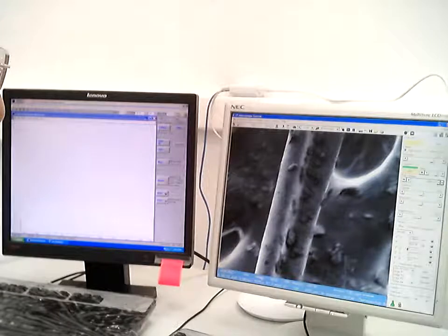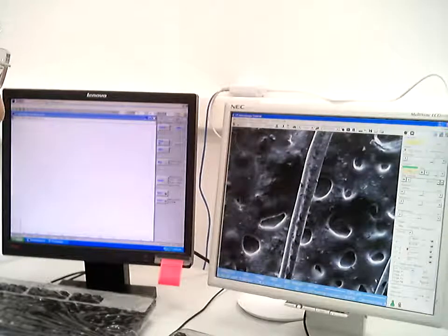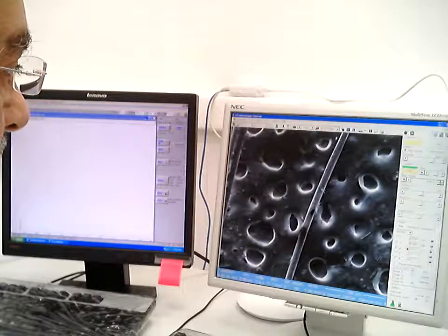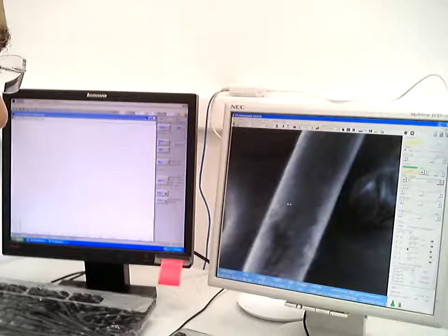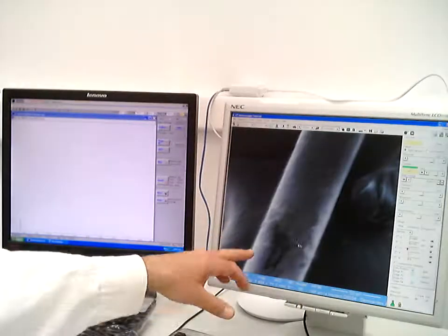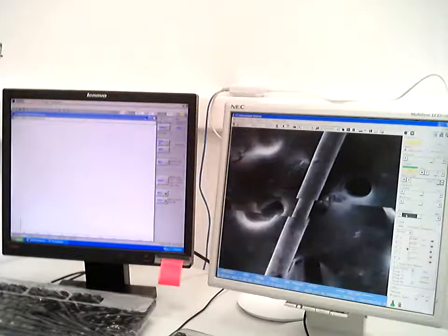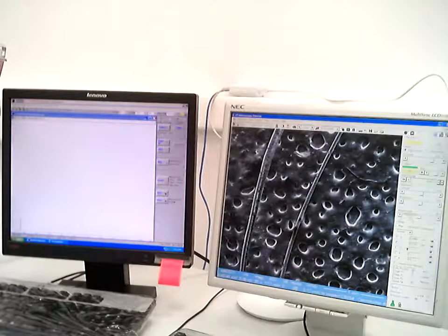Next to it, there's another hair, which looks similar. Let me have a look. This may be human hair. Let's focus it a little bit. The magnification is 1500. It's not easy to focus, but it looks human. Let's see another hair. It's a much thinner hair, and I have a feeling that this is a woman's hair.